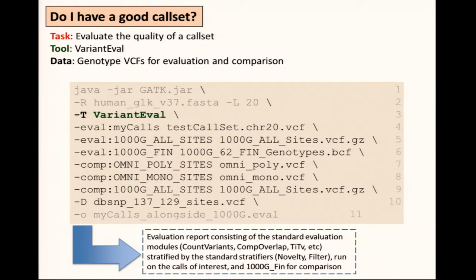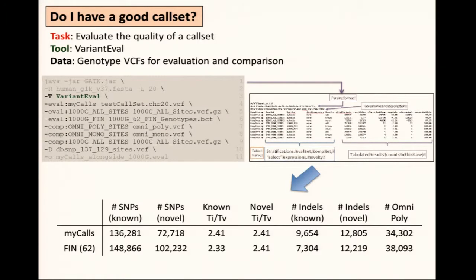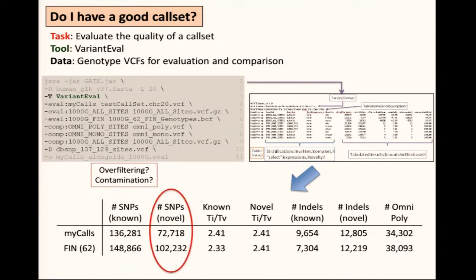The output is a table you can digest by eye or by pulling it into R. You can see the known transitions and transversions — they're a little bit different between my calls and the finished samples, but not too extremely different. The novel is spot on. But in terms of the number of novel SNPs, there's a depletion of about 30,000. I would have expected to see about 100,000 calls not in dbSNP127 just by sequencing 62 random samples from Northern Europe — instead I'm finding 72,000. So this immediately pops out as a potential issue.